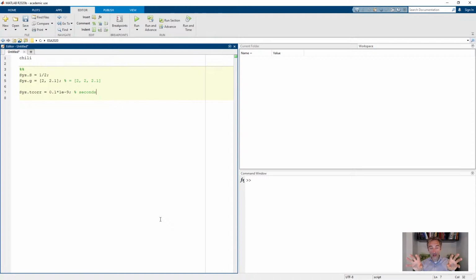It means if you have 2 nitroxide molecules in this particular sample, or it's a solution, it will take about 100 picoseconds before the orientations become uncorrelated. So if you take those 2 nitroxide radicals at time 0 with the same orientation and you let them just diffuse around, after 100 picoseconds, you can't tell anymore that they started out with the same orientation 100 picoseconds ago. So that's what the rotational correlation time means. This is the rotational correlation time.